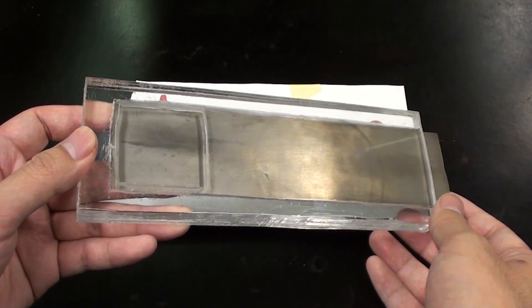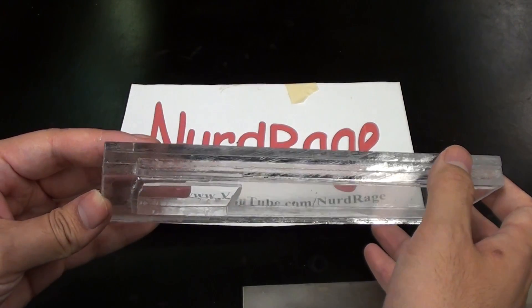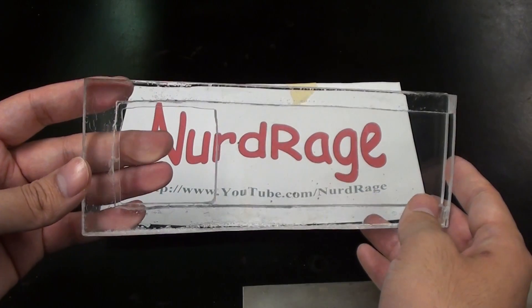Now for those of you with 3D printers, it would be much faster, easier and more straightforward to simply print the whole compartment using acrylic filament. And I strongly recommend doing that to save yourself time.